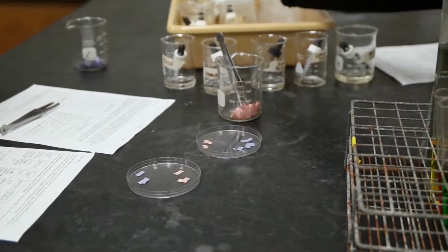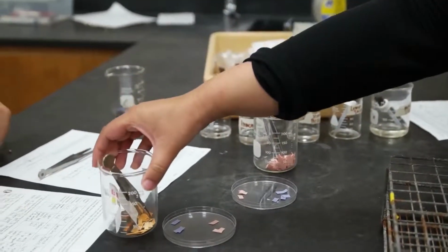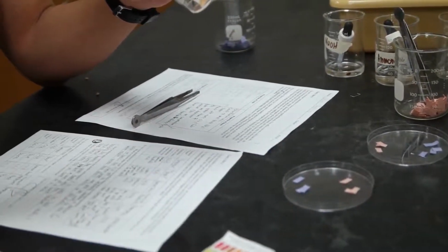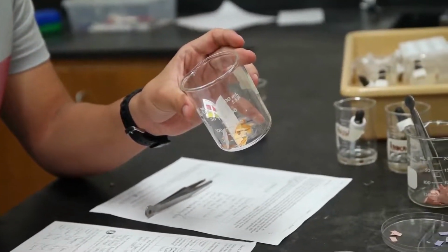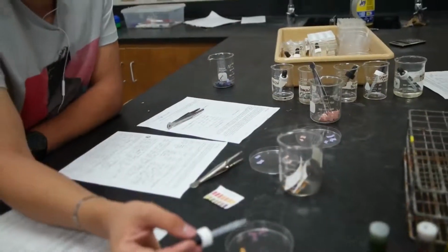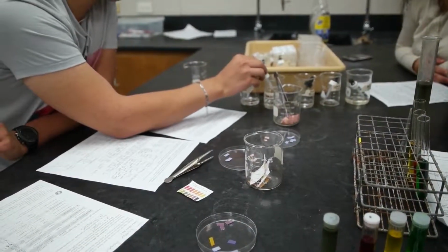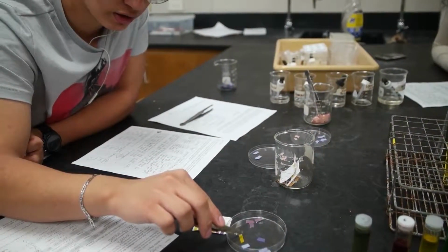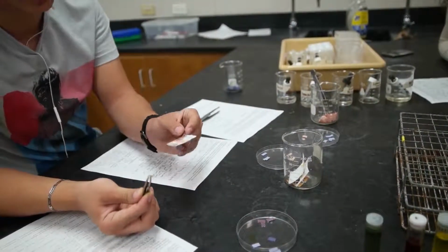Then I could give you even more information by giving you this type of paper. Do you want to explain what this is and how to use it? Well, this type of paper determines the pH of a solution, and you use it the same way you use the regular litmus paper. This paper can turn a variety of colors, and you compare the paper to the chart, and with the chart you'll be able to see how much pH the solution has.